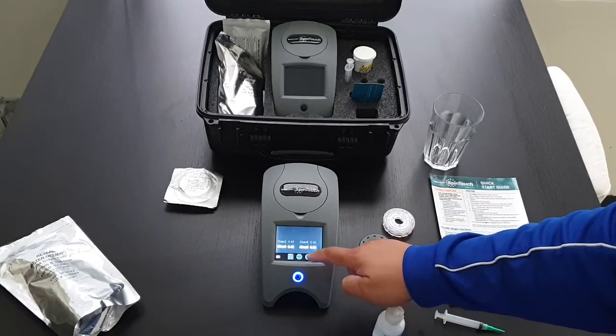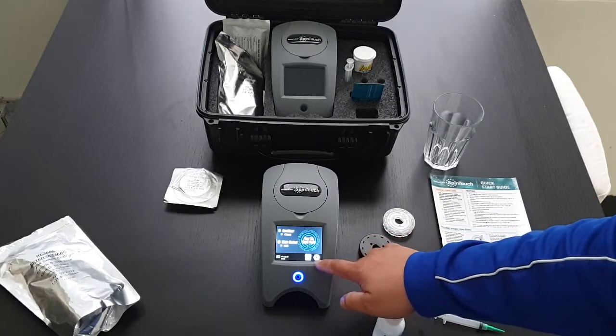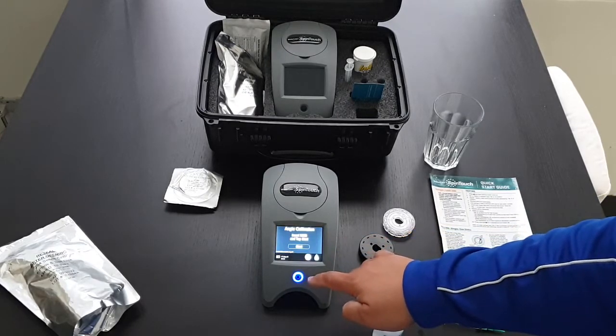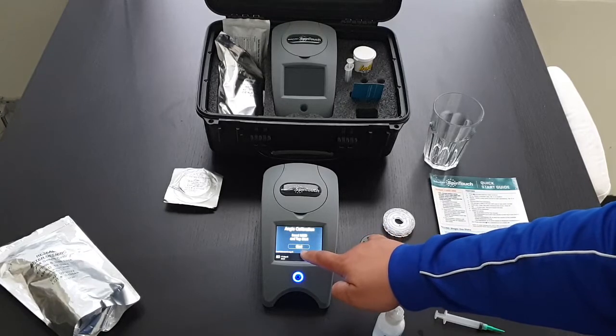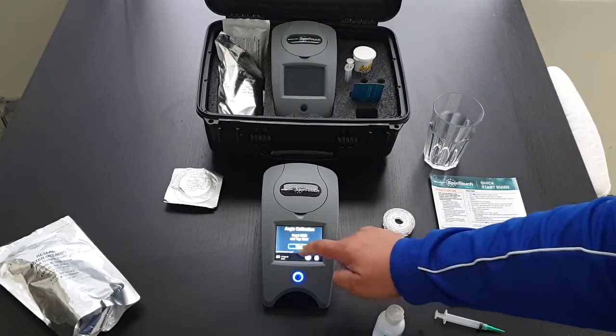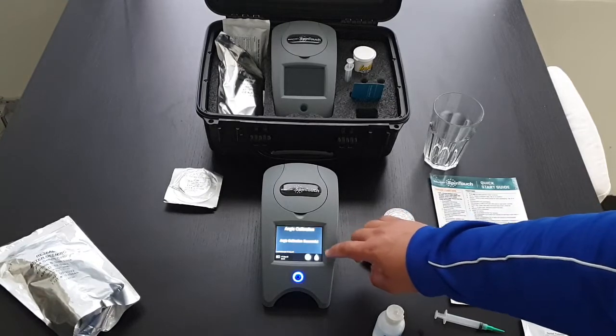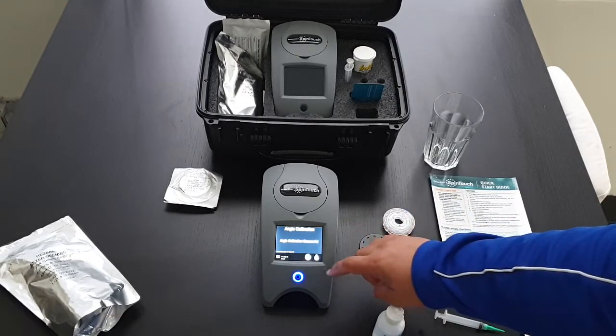To calibrate, go to settings, then calibration. Insert the meter check disc and tap start. This goes through and calibrates each channel. And that's it — calibrated. There's a little tick to accept.